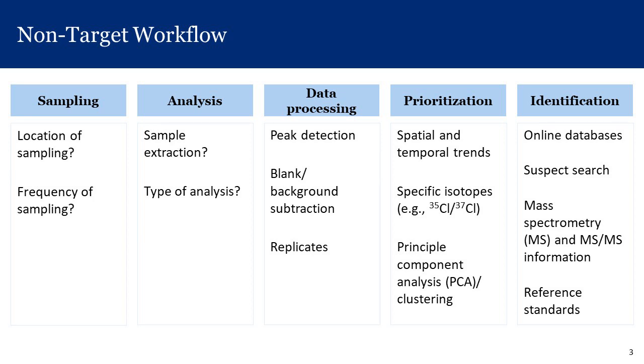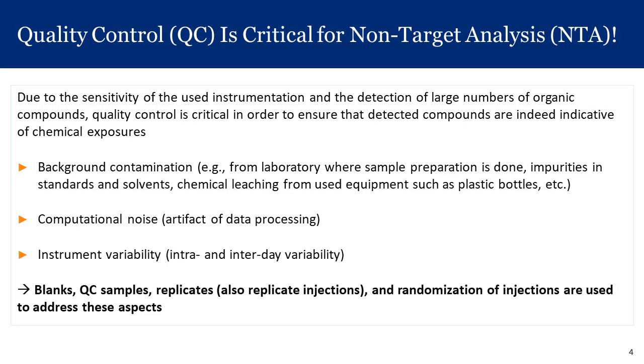And this is really important if we think about risk assessment and the concentrations and the potential risks that arise from these exposures. Due to the large amounts of data that occur with the large number of compounds, one very critical aspect to consider, and I would say one that takes a majority of the time in the data analysis, is quality control.